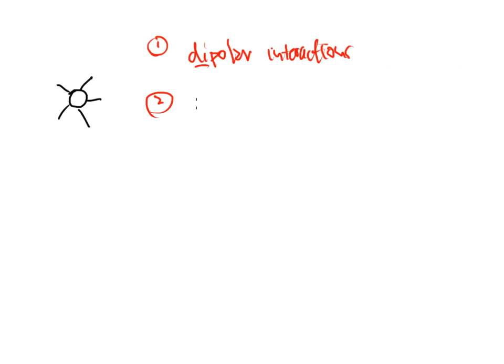What you're going to find out is that the stronger the interaction, the longer the retention time. That kind of makes sense, right? So if I've got a particle that comes into the picture, and that particle makes its way to the stationary phase, and it stays here for quite some time, maybe like in-laws coming into your house and staying there for weeks at a time before they leave, this is going to cause some retainment in the system, right?